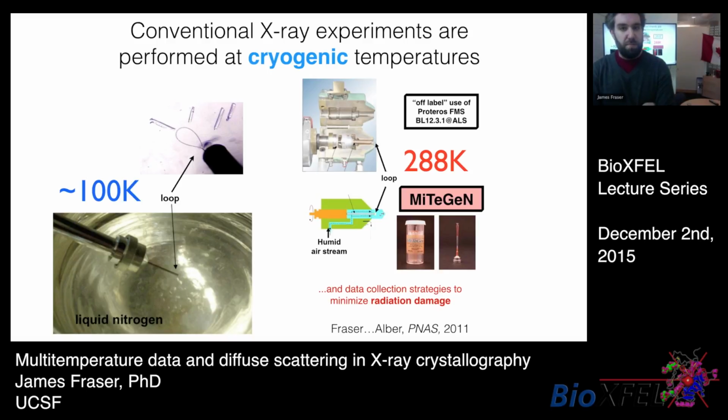We also have to pay special attention to the way we collect the data to minimize radiation damage effects at conventional sources. Although now, with the potential to outrun radiation damage through more diffract-and-destroy type experiments at XFELs, we can get all the benefits of room temperature data collection without really any of the downsides.